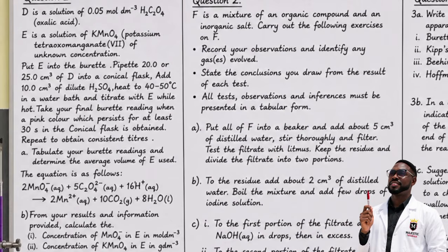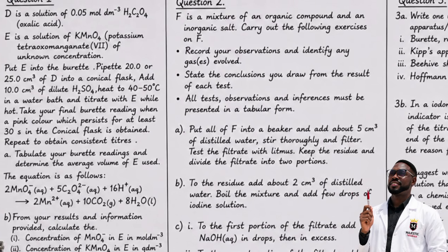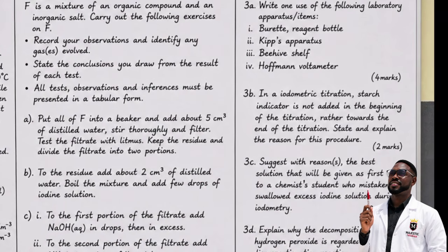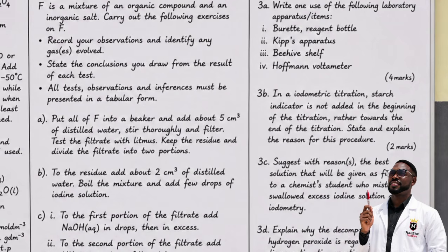It's not going to go far. This salt analysis is exactly what it's going to be. So, this is a Majestic guide. And these are the possible question number 3. You know, the specimen for alternative B in salt analysis looks a bit similar to that of A, at least starch is there. And that's why I'm suspecting that number 3 might look similar, okay?